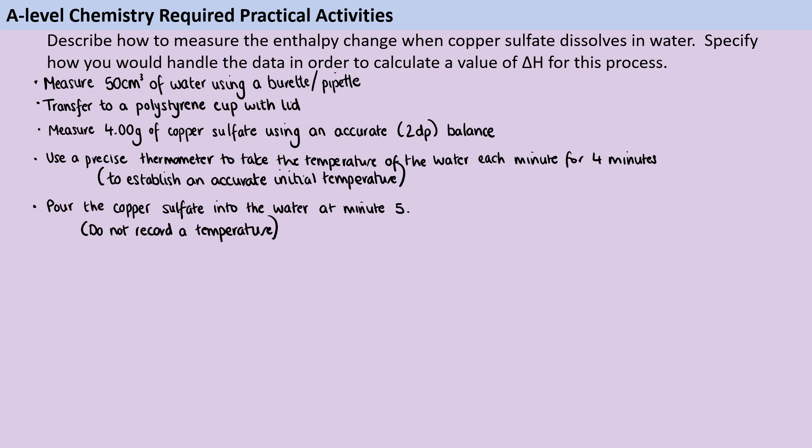Once you've completed this, you're not going to rinse out your weighing boat, because if you did that, you'd be adding more water that you hadn't taken account of, and the whole thing would mess with your results. We're definitely doing the weighing before, weighing after method here. We're then going to re-weigh the weighing boat to establish the accurate mass of copper sulfate that was actually transferred, not just the mass that you put into the weighing boat in the first place, taking account of any residue left over.